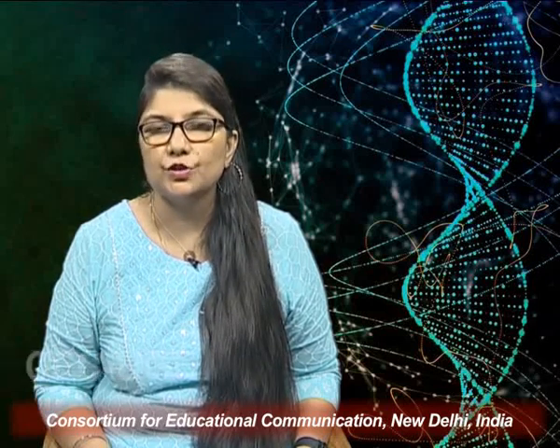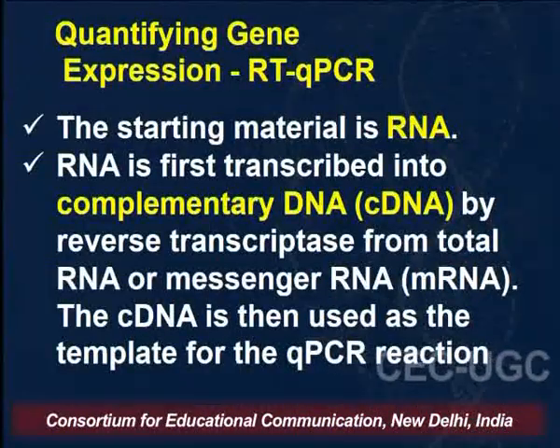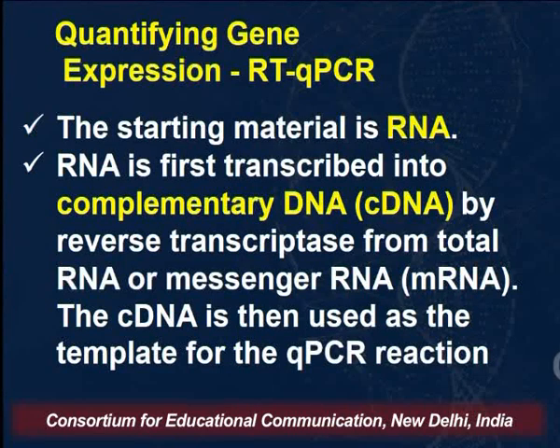The major application of this is to quantify gene expression. When we talk about gene expression, we are not talking about DNA, but about RNA. So there the template or the starting material is RNA. When we are trying to quantify the amount of RNA that is present in a cell, we can use what is called RT-qPCR. You can go back to the polymerase chain reaction session and see what RT-PCR means.